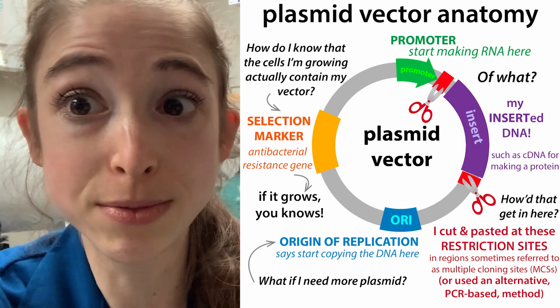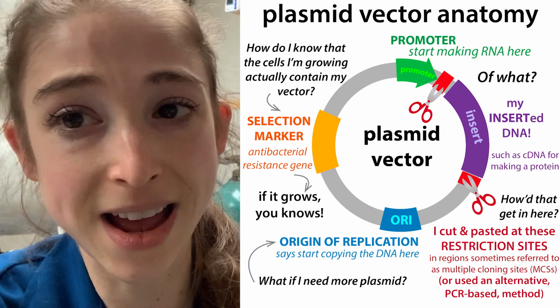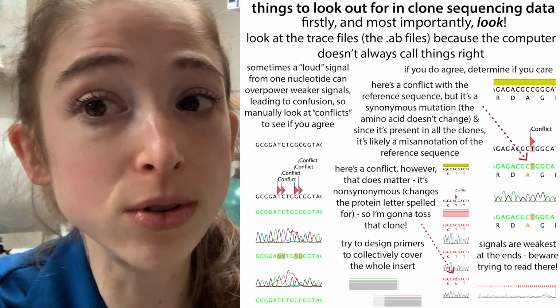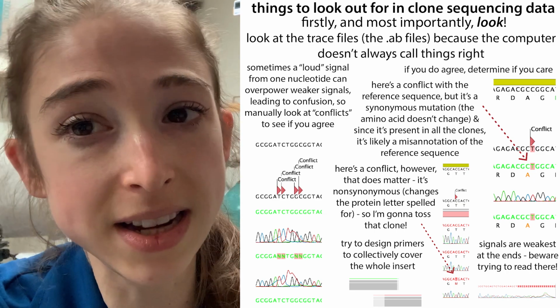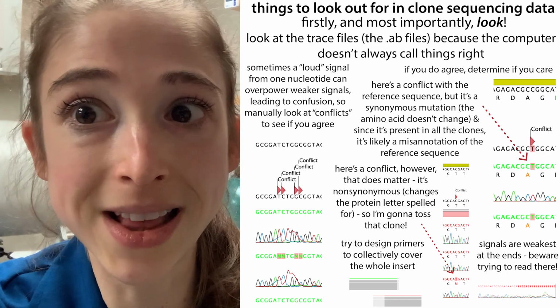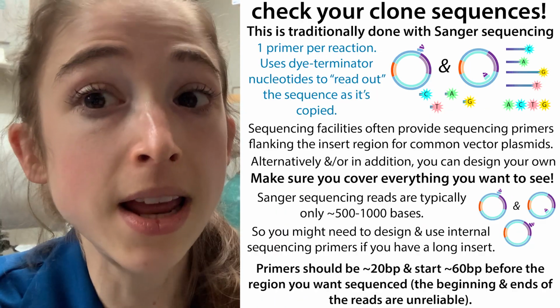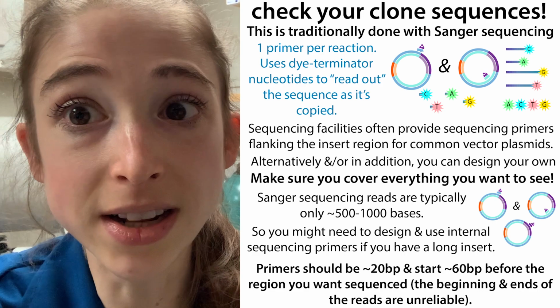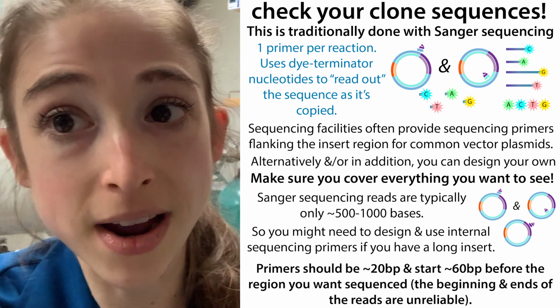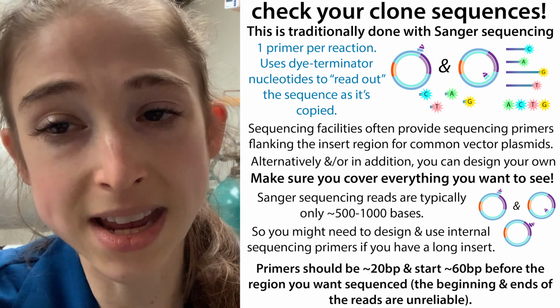You could have gotten a plasmid with a totally different gene inside. That happened to me once, so true story, it happens. Even if it's not a whole different gene, if there are typos in it, that could be messing up your subcloning from it, as well as expression from it, and all sorts of different things. Bottom line, you save a lot of time and energy in the long run if you verify that sequence in the beginning, or at least you can if there's a mistake.